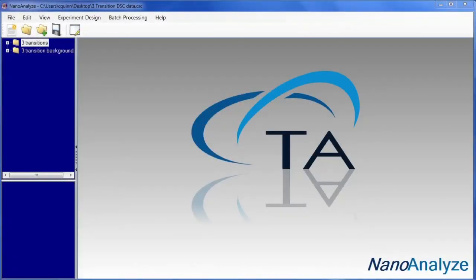This TA Tech tip will discuss fitting multiple transitions in a DSC thermogram. At this point, NanoAnalyze has been opened, and the data and the background files have been loaded.